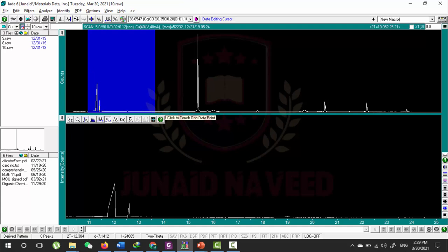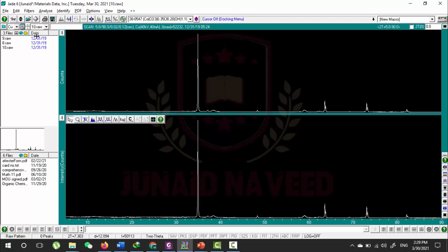One good thing is that JADE will not save this data to your original file. I will not recommend this work for unprofessional purposes.